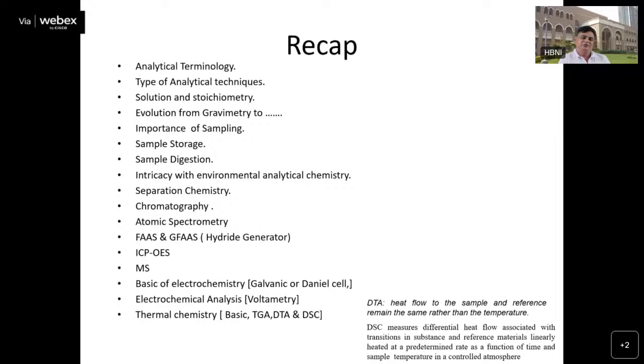Depending on the various kinds of electrodes, we saw how to improve on classical polarography. There are certain problems in classical polarography, because we cannot control the size of the mercury drop or the applied voltage. Earlier, before the improvement in the microprocessors of electrical instrumentation, we could not distinguish differences of 0.2 volts.